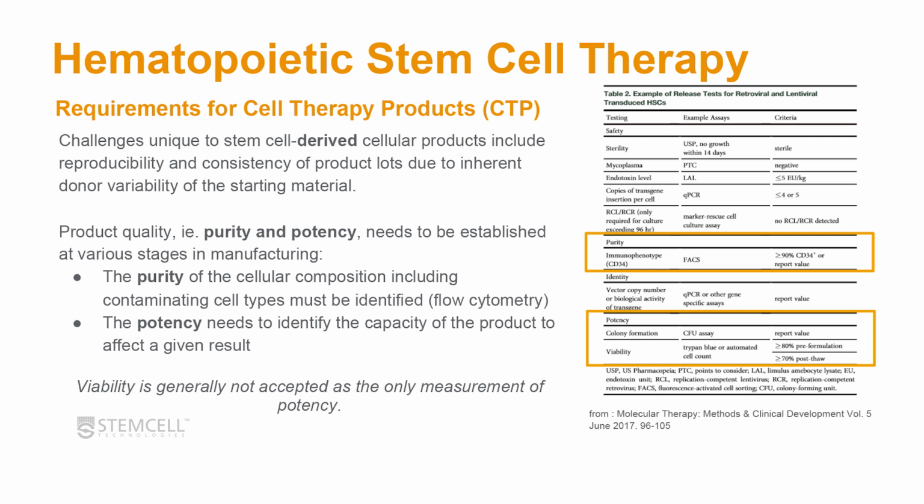But they also ask that the CFU assay be done and a value reported. But really, what value would that be? The fact of the matter is, it really depends, again, on the treatment that you're doing and the manipulation that you're doing. So if you started with cells that had a high CFU frequency, then post-modification, you would expect that reporting the value, there would be a percentage that would be acceptable, like 80% or something. So these are really key, important measurements that need to be confirmed before you can release products to therapy.